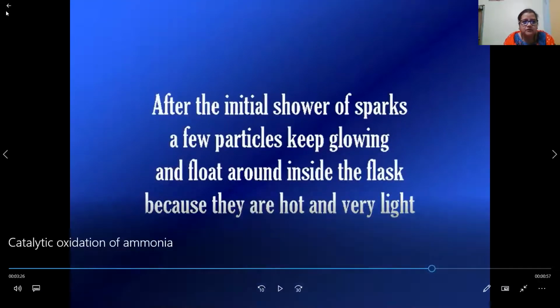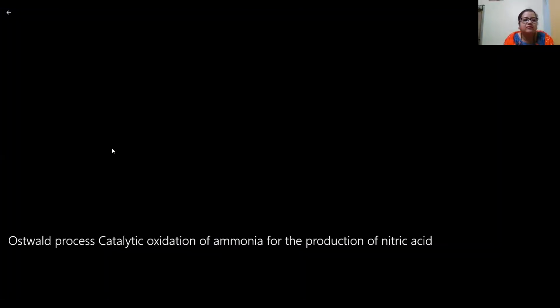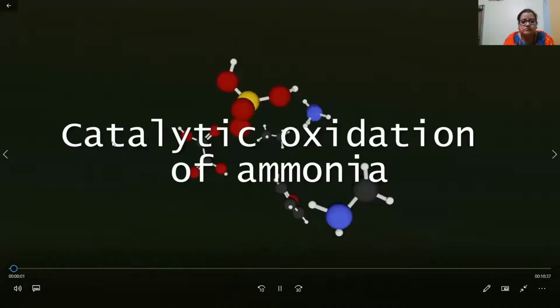Okay, now you can also see some other things like you have here. This is also there.